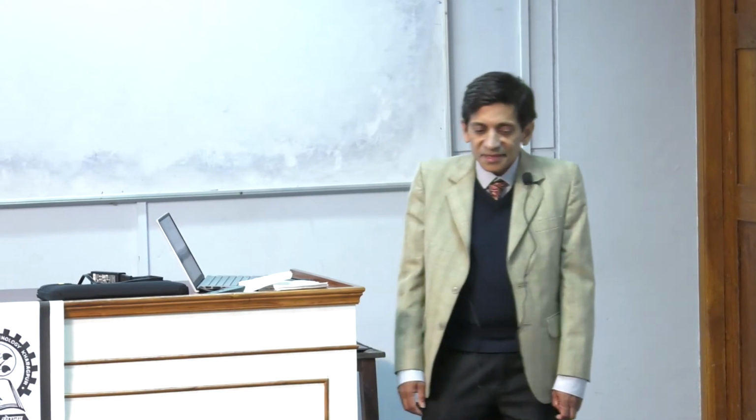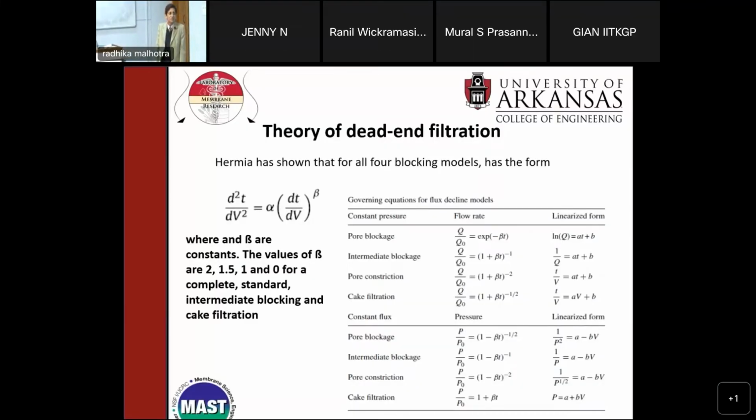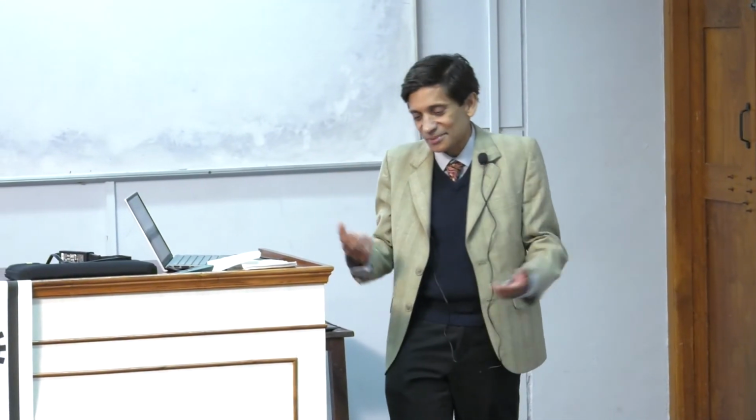That's interesting, except there's a problem, because as I told you, that assumes you have straight through pores. And the problem is that often you get values of 1.5 or 1.67 or 2.1 or some odd number. Okay? So then what do you do? Do you say I just round up to the nearest one, or what do you do? That's one problem that occurs.